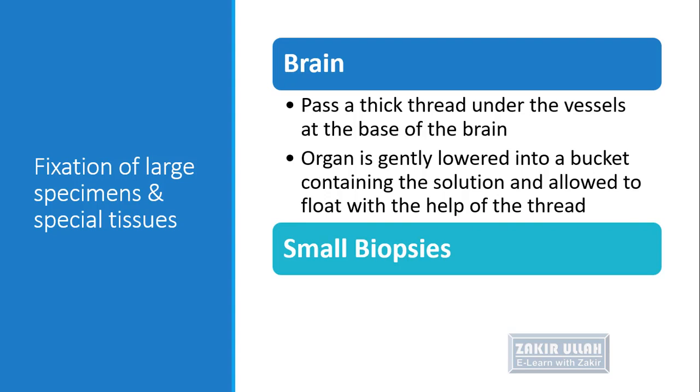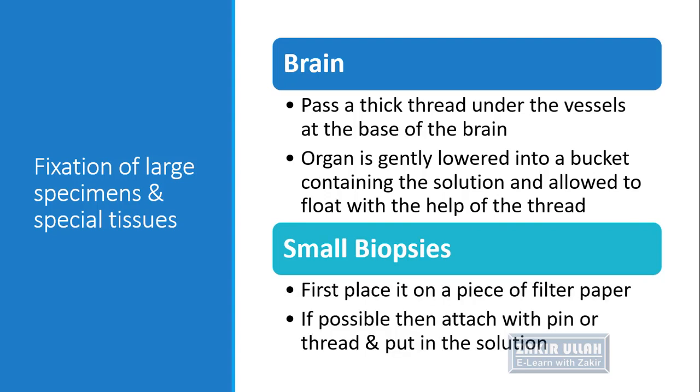Small biopsies should first be placed on a filter paper, and if possible, a pin or a thread attached to the biopsy. In certain conditions this is important, but it is not necessary that we should always attach a pin or thread. Then put the biopsy in a solution.